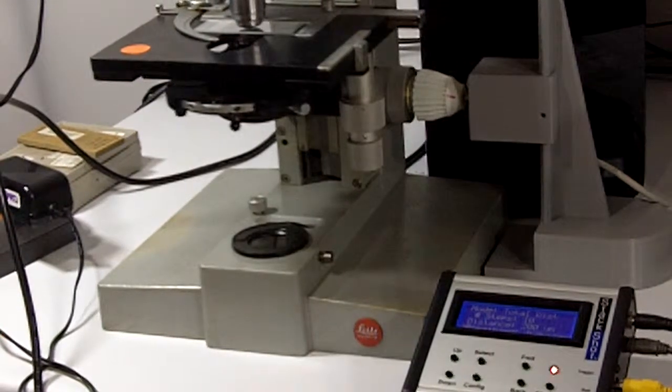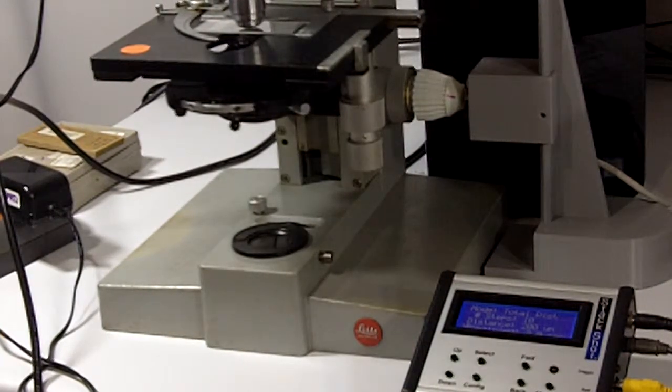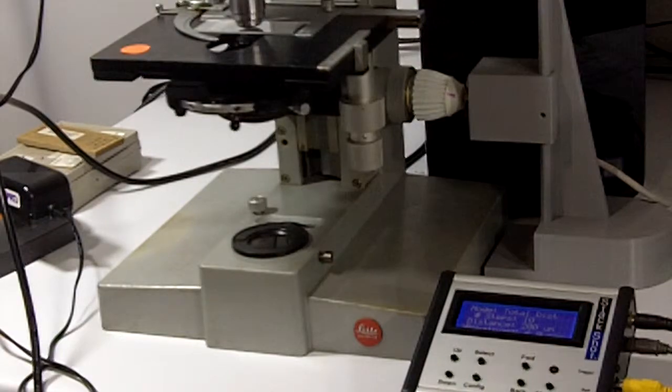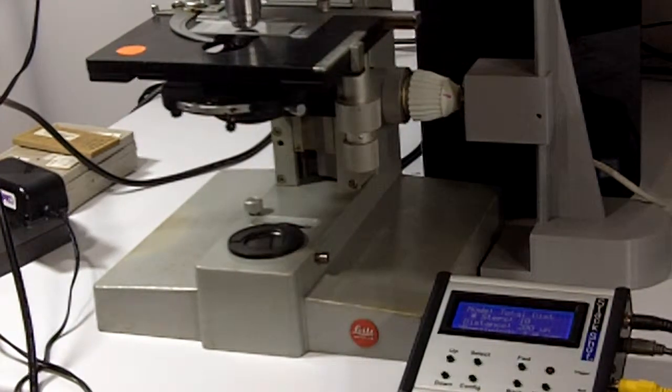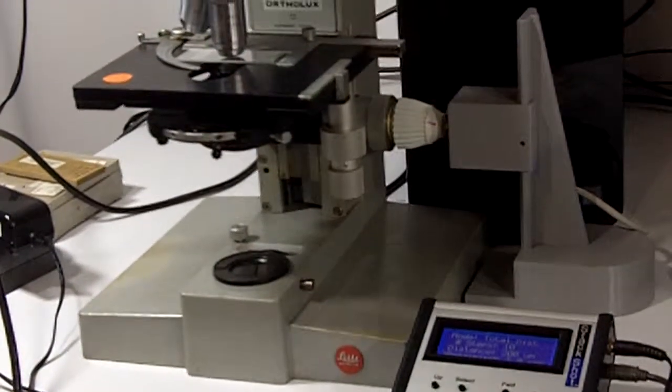Today we're showing the second part of a new product called Retro Zed. This is a freestanding unit that can be used on different microscopes.